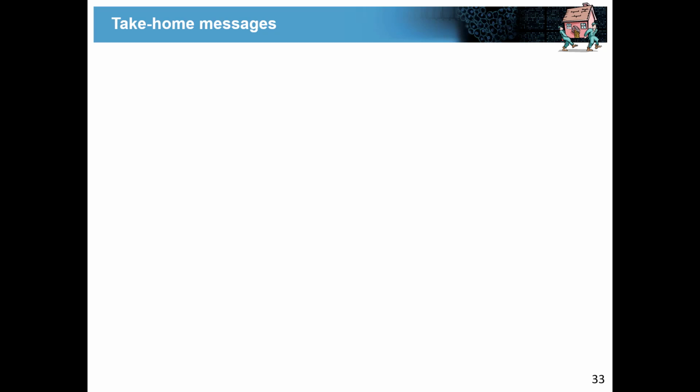That's what people also do, right? They make their instrument-specific libraries or instrument-specific assays. Okay?